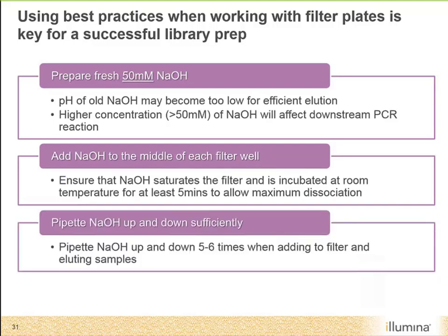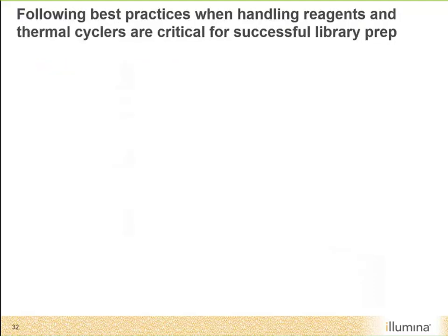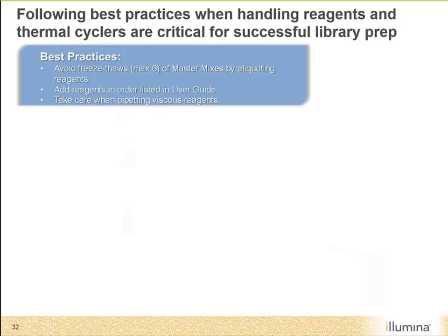We also want to make sure that we're pipetting the sodium hydroxide up and down sufficiently, at least 5 or 6 times, when we're adding to the filter plate and when we're eluting the samples off. Another key component is, there are a lot of different reagents being used within this protocol, and a lot of different equipment. So following best practices with handling reagents and thermocyclers is one thing to keep in mind.